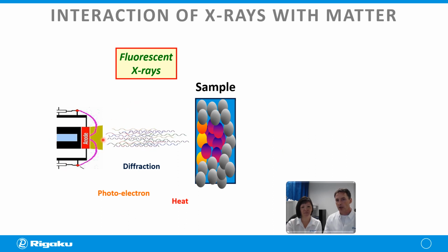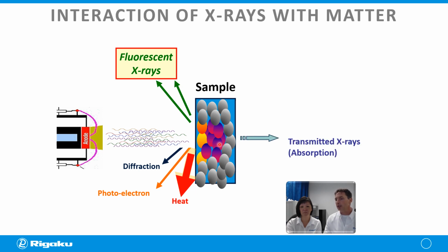So just to show it on a spectrum here, we have different energies. We have a polychromatic source. Now that source is dependent on a certain anode, a certain target material within that X-ray tube. In most of our systems, either palladium or rhodium, a middle Z element, allows us to excite the whole spectrum. Most of the incident X-rays are lost as heat in the sample. A certain amount produce fluorescent X-rays. If you have a highly ordered sample, you could get diffraction. That's really only the case where maybe somebody's analyzing semiconductor wafers or highly oriented materials. And then we can get transmission through the sample, as well as one element producing X-rays that can excite another element in the sample. This is the absorption or the enhancement that occurs. These are the matrix effects.